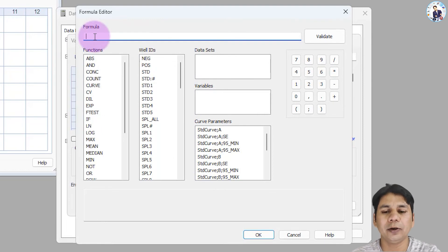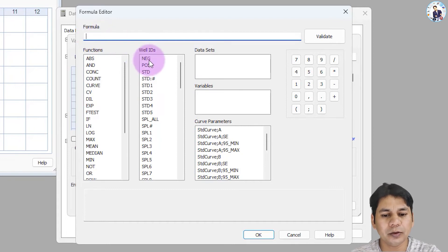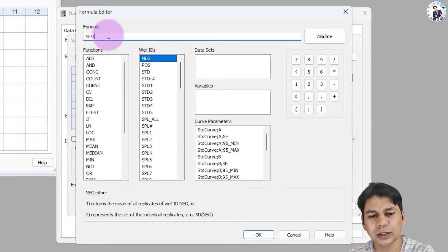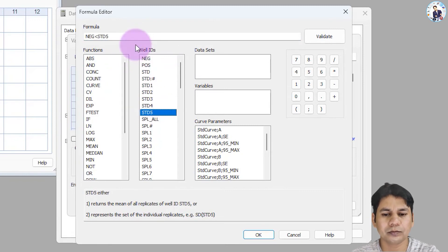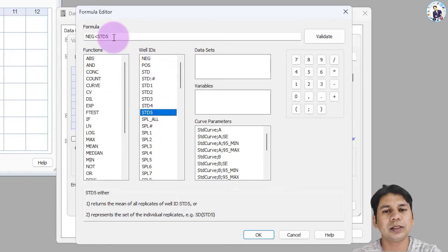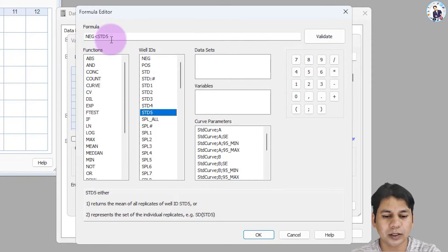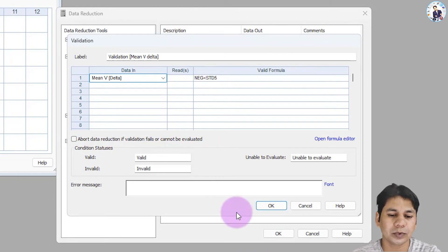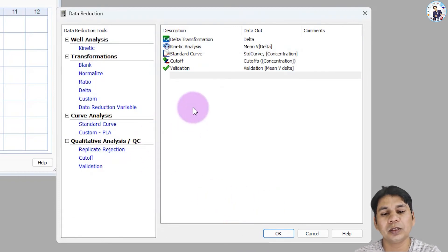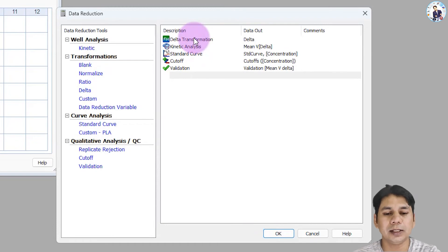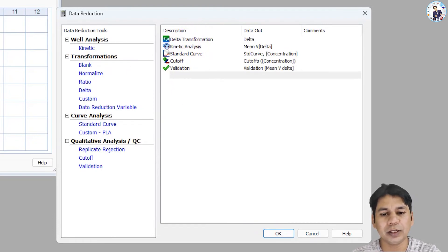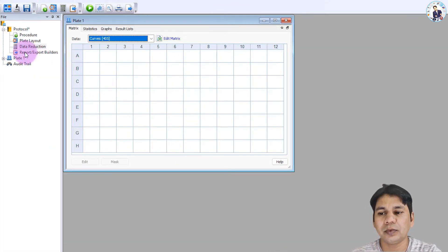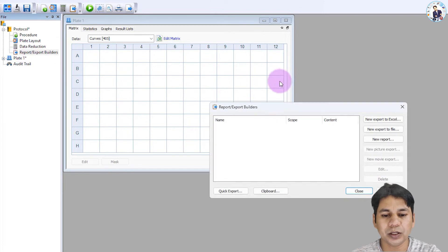You can build your formula here. Our validation step for this clinical assay is: if the negative is less than standard 5, then the assay will be valid. Click OK, and you can see the formula is shown. Click OK again. Each step for this clinical assay data reduction is now assigned. Click OK.